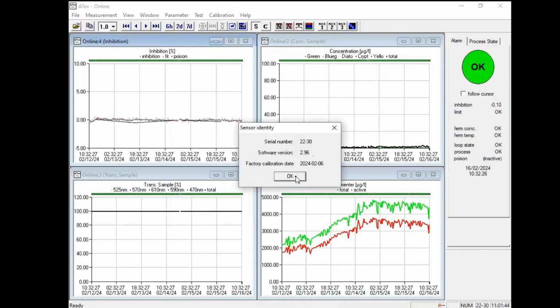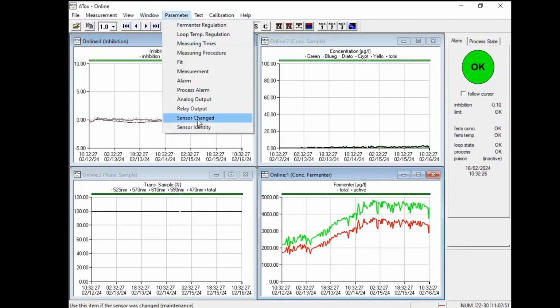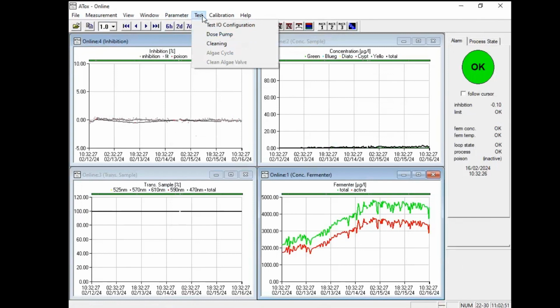So the sensor knows all the parameters necessary to control the sensor. The sensor has a computer. After such a calibration, or if you put in a new sensor, it normally automatically detects the serial number of the sensor, and if the serial is changing, it reads the parameters of the new sensor. But if you have a differently calibrated sensor, normally it reads the data from the sensor, but you can also manually trigger the reading of the calibration.